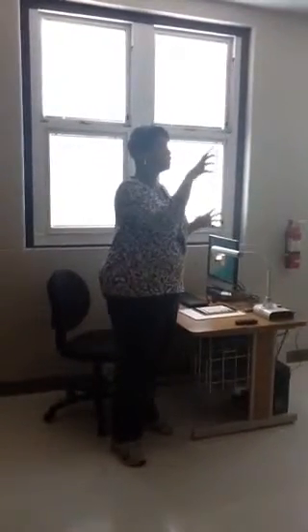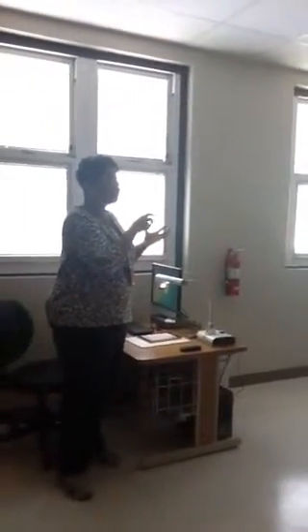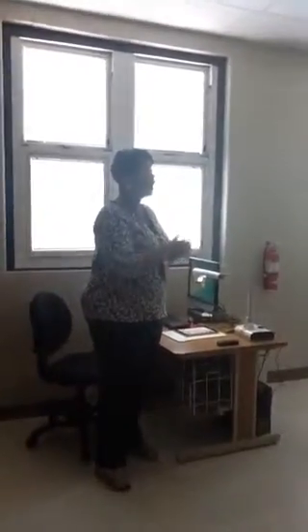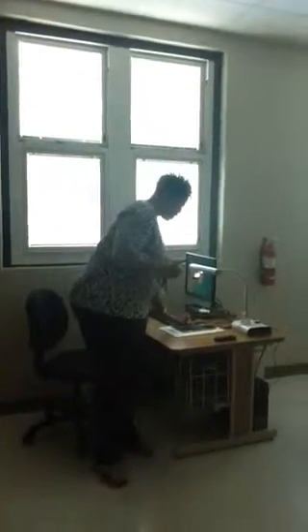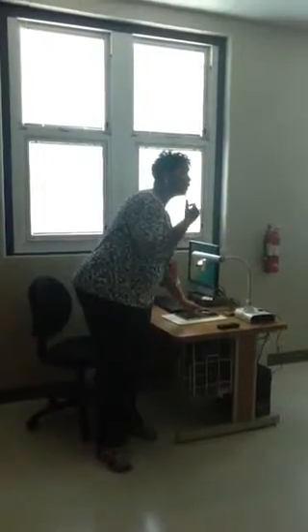What you'll see is that we're going into your technology, going into Safari, and actually looking at an earthworm dissection. Since you've got an opportunity in real time to see what the dissection looks like, I want you to be able to go into your technology and say, oh, okay, this is what it's talking about. A lot of good videos are going to come up.